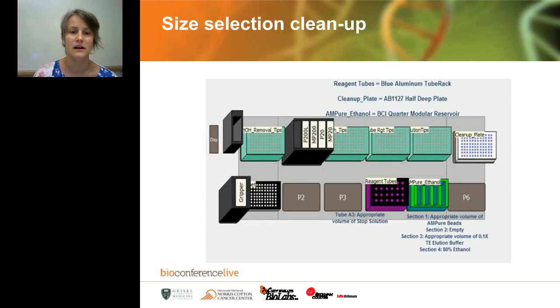And then we also have the cleanup plate set up here, and we also have the magnet, which we set up right on the deck so that the gripper is able to take the plate from the orbital shaker and put it directly on the magnet, so that we can do all of that on the deck.